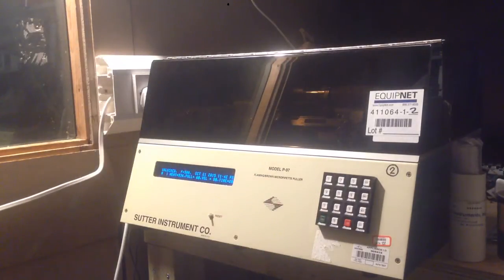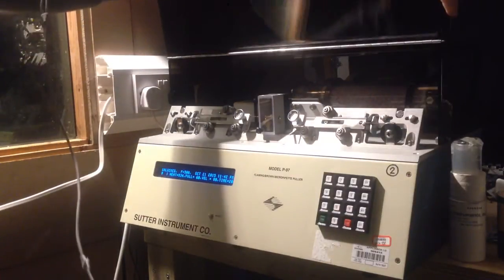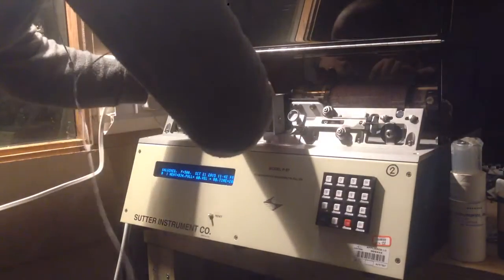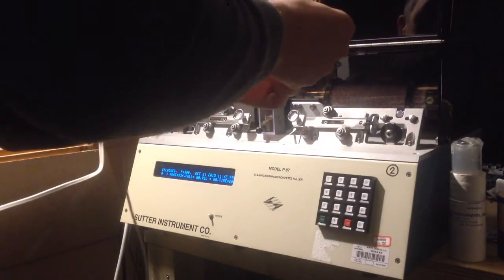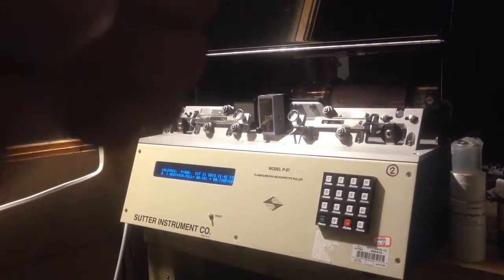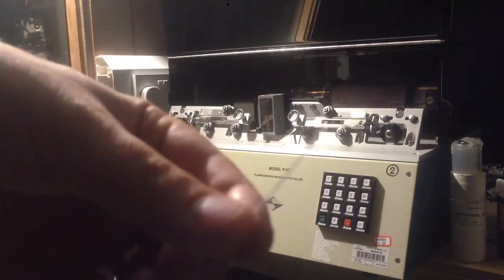These tubes I found on eBay — about $10 for 500, so roughly a dollar each — you buy them in lots of several hundred. We close the lid and press pull, and you can see the filament lighting up and heating. Hopefully it doesn't explode — and there we go, that's it! We have some beautiful pipettes.